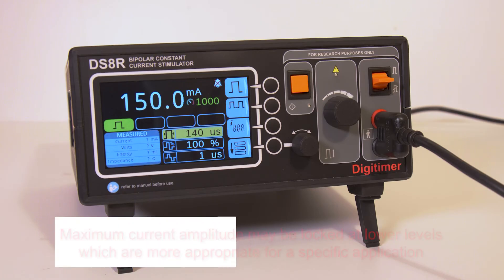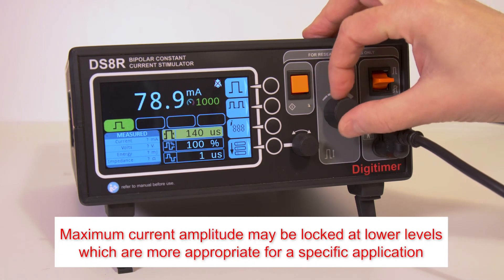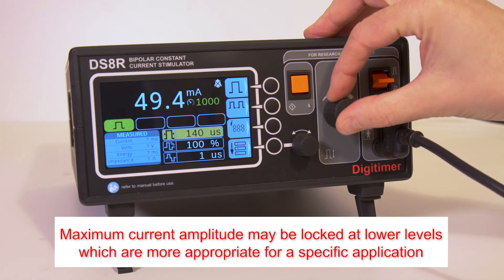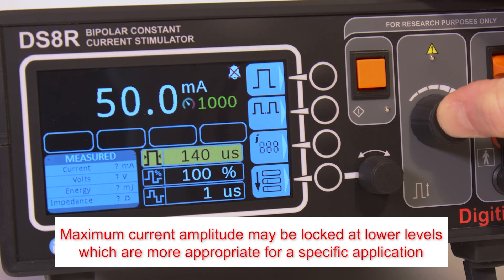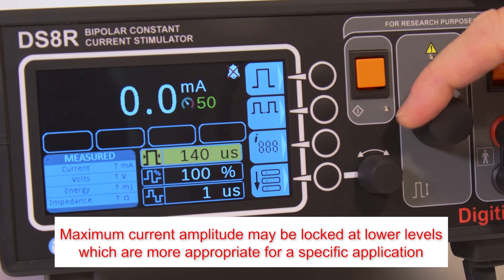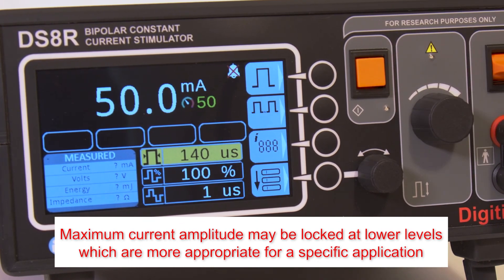The DS8R features a current amplitude lock which allows the user to set a maximum level for stimulation. The current setting is reduced to the desired maximum level — in this case 50mA. The amplitude control dial is then pressed in and held for a few seconds, activating the 50mA limit, indicated by the changed icon on the display. It is not possible to exceed 50mA either manually or through software control until the amplitude dial is once again pressed in and held.